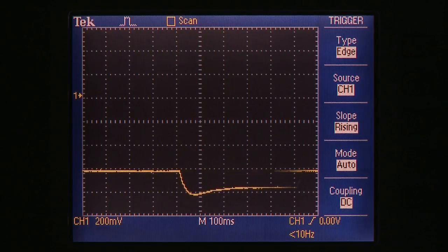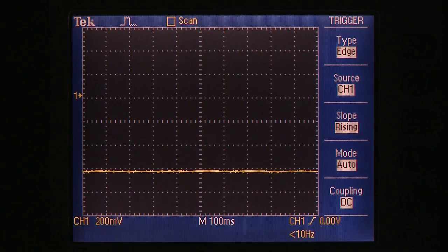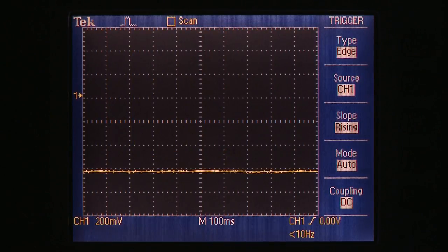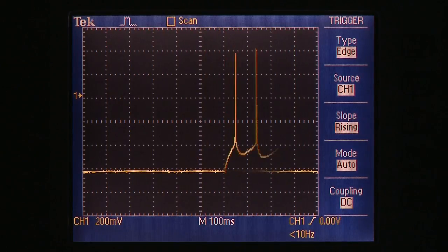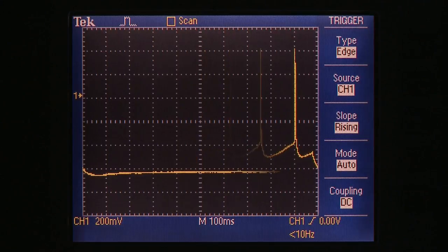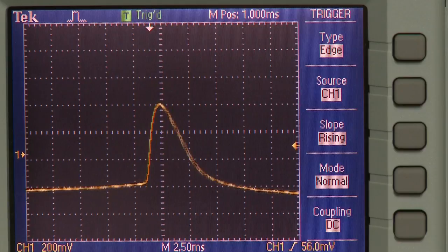Then we switch to the current clamp mode to measure the membrane potential. We can then start injecting current into the cell. Here we apply currents for 500 milliseconds. First we apply hyperpolarizing current, then we increase the current and depolarize the cell and see action potentials. The more we increase the current, the more action potentials we see. In this case, we are recording from a neocortical layer 5 pyramidal cell.